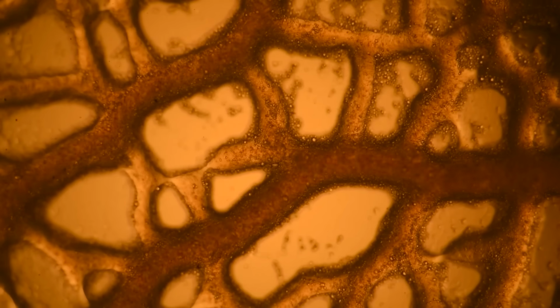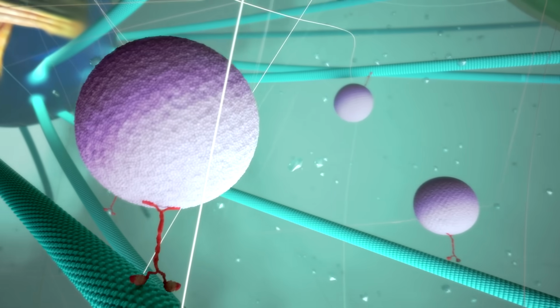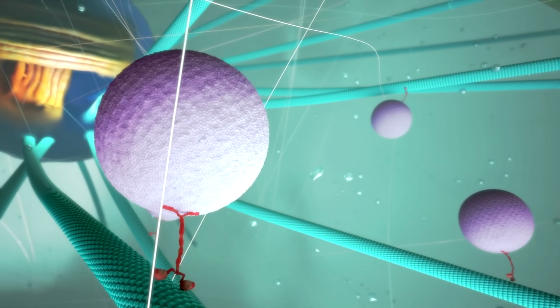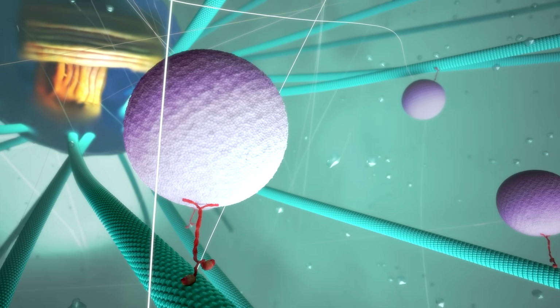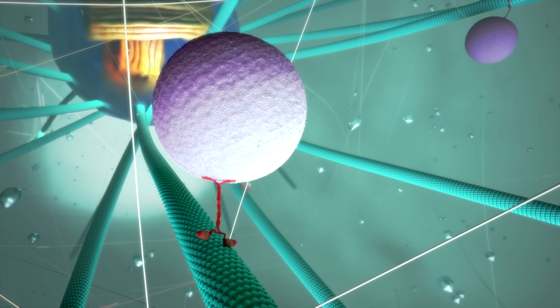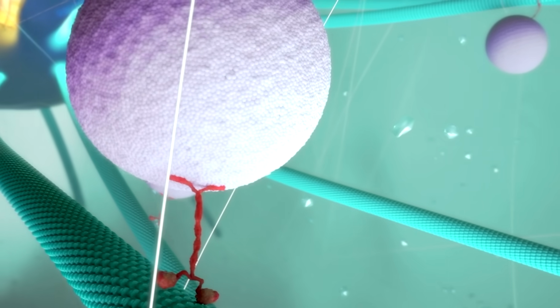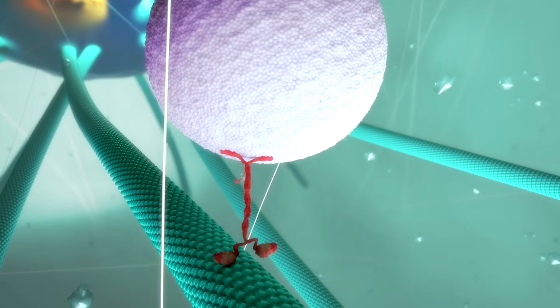But watch what happens when I speed this clip of Jerry up a little bit. Look at how everything pulsates. This is the result of the network of actin and myosin that Jerry builds and controls. Jerry also makes extensive use of kinesins and other motor proteins. If you've never seen these before, they're the super cute proteins that walk up and down tubulin fibers inside of cells. So technically, Jerry does have legs, but only on the inside.